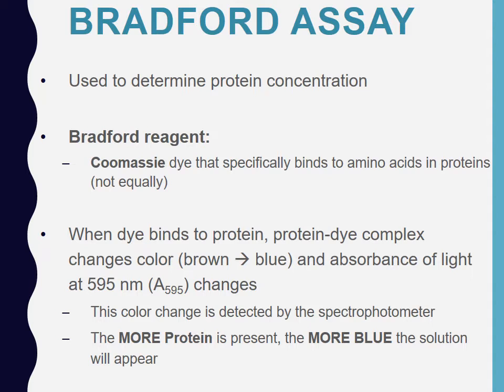And so in particular, since we are looking at absorbance by proteins to determine protein concentration, usually we read that absorbance at 595 nanometers. And so in your assay this week, that's what your spectrophotometer is going to be set to read at.